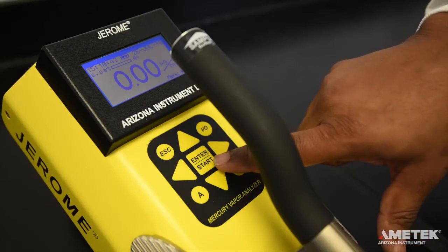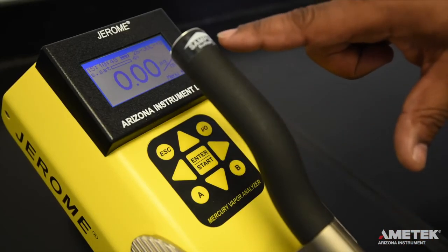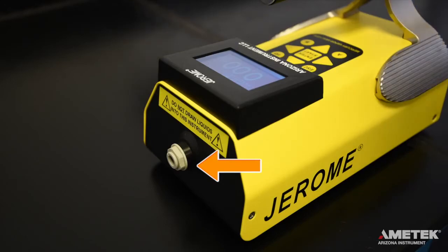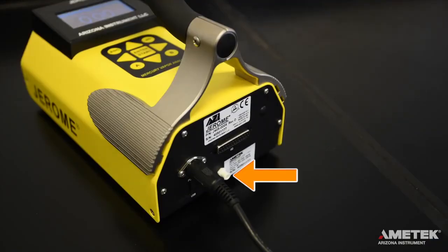To take a sample, you can either press the enter button on the keypad or the silver sample button at the tip of the handle. At the end of the sampling cycle, the reading will appear on the screen in micrograms per meter cubed or milligrams per meter cubed. It is important that you do not obstruct the intake or exhaust ports. Do not allow the probe or the intake to draw in liquids. At the end of a sampling day, or if the sensor becomes saturated, perform a sensor regeneration cycle.